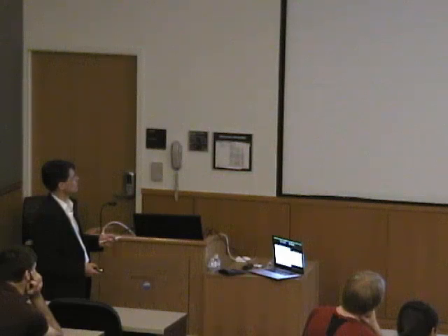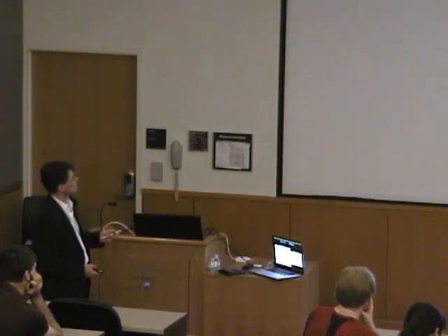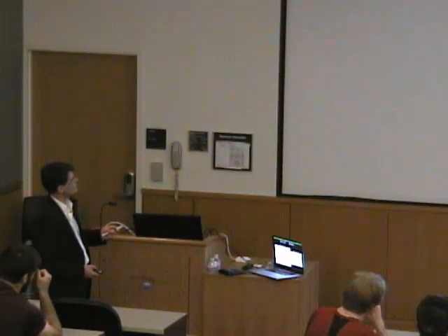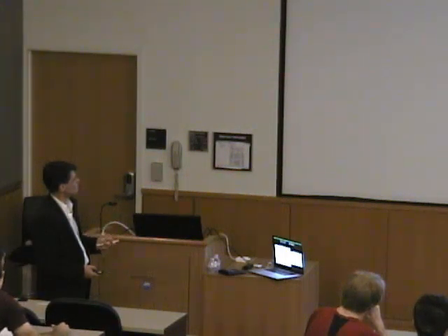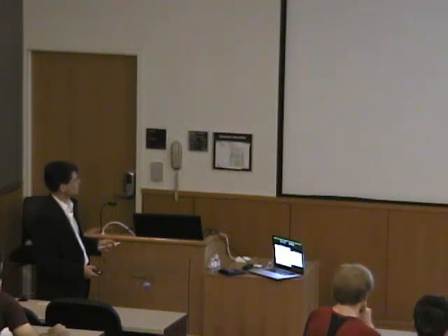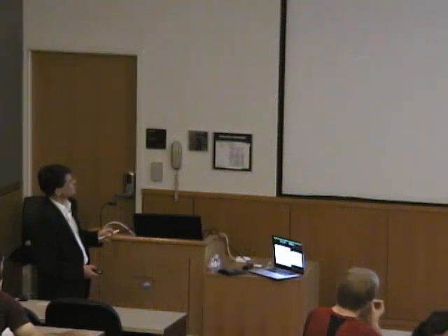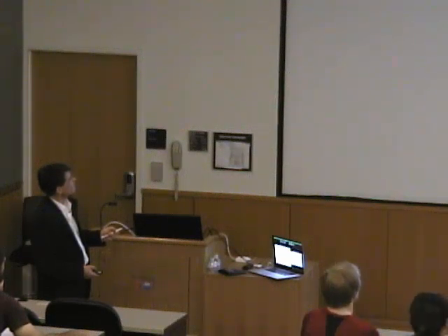For example, low spin iron(II) is essentially MCD silent, with super weak MCD signals. I'm sorry for the small letters, you can probably not read it. High spin iron(III) has a very rich MCD spectrum, however with very low intensity. Low spin iron(III) has very intense, richly featured MCD spectra. Especially there is a funny MCD here in the near-infrared region of the spectrum. And high spin iron(II) also has characteristic MCD. Now, Andy Thompson and Miles Cheeseman over the years have analyzed this part of the low spin iron(III) porphyrins very carefully.